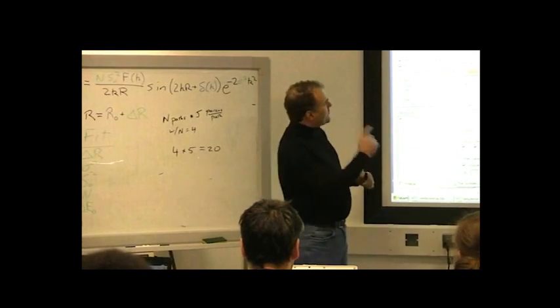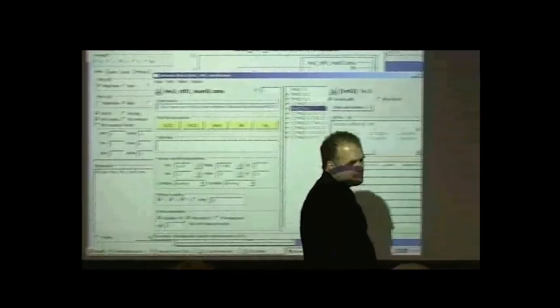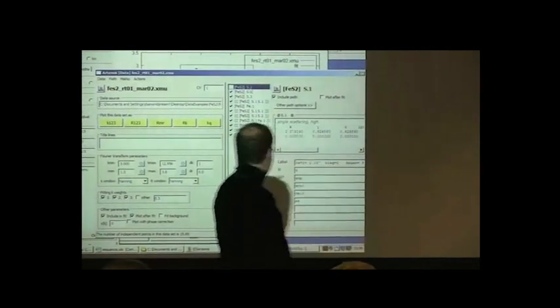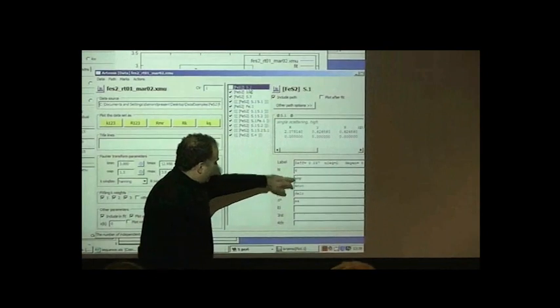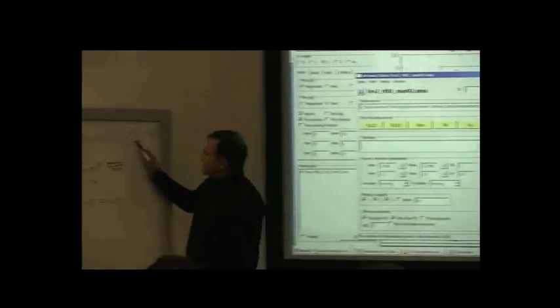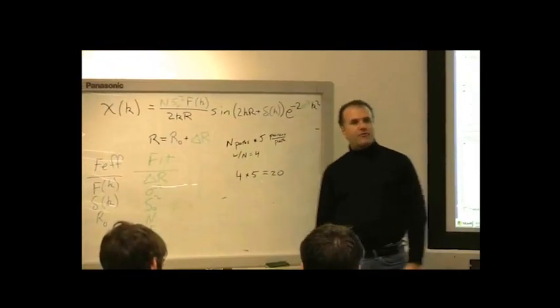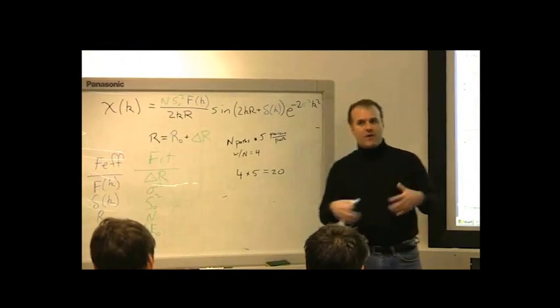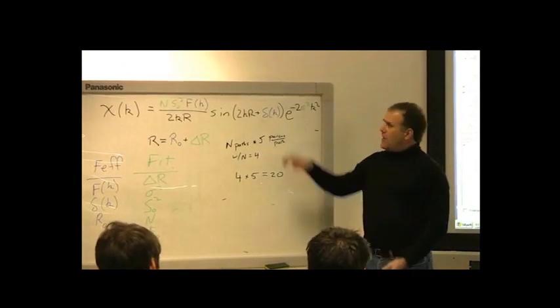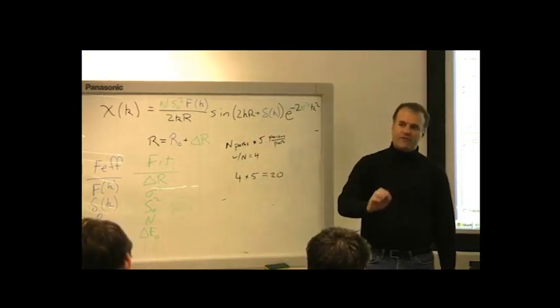In the first fit that we did, where we fit just the first coordination shell, and we made these parameters, amp, E naught, del R, and SS, we used the parameters of the EXAFS equation as the parameters of the fit. That is how we evaluated the fit to the first coordination shell. In that fit, the parameters of the EXAFS equation were the parameters of the fit.